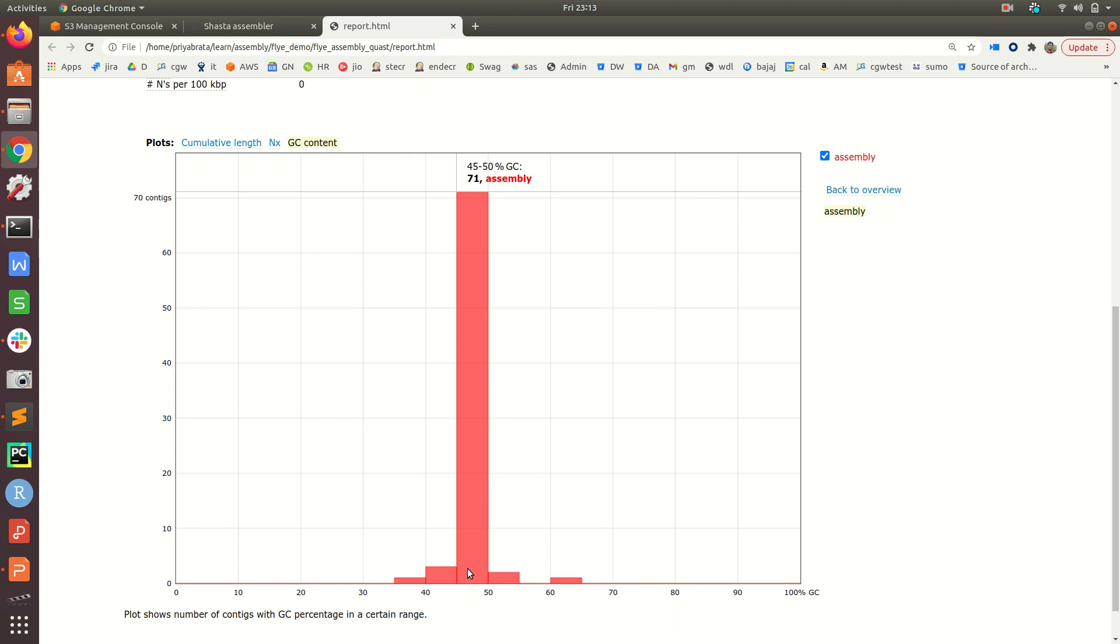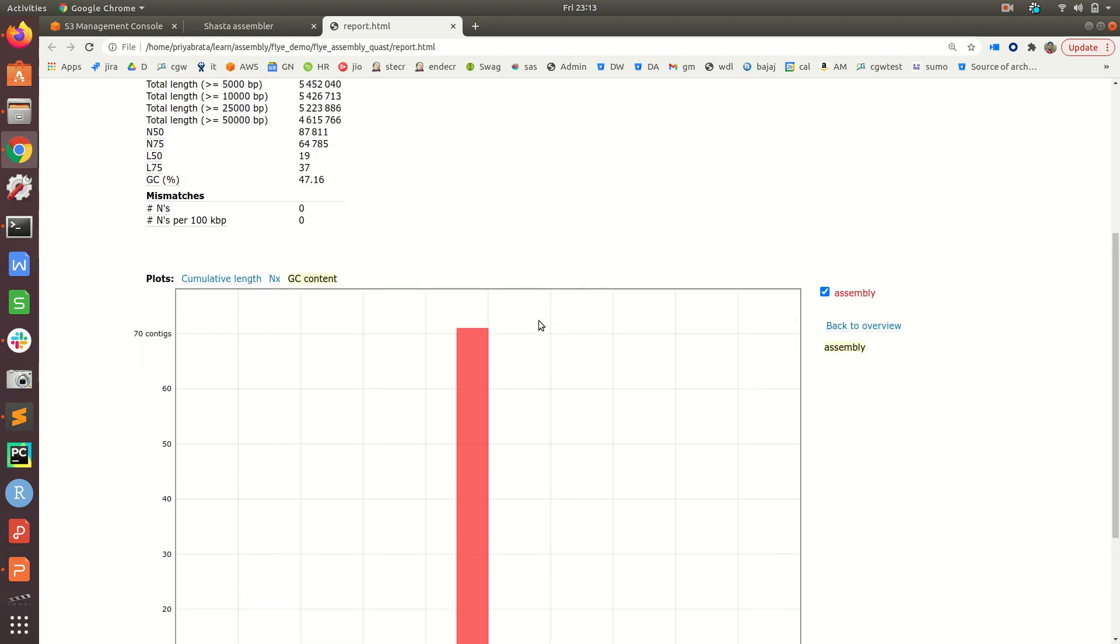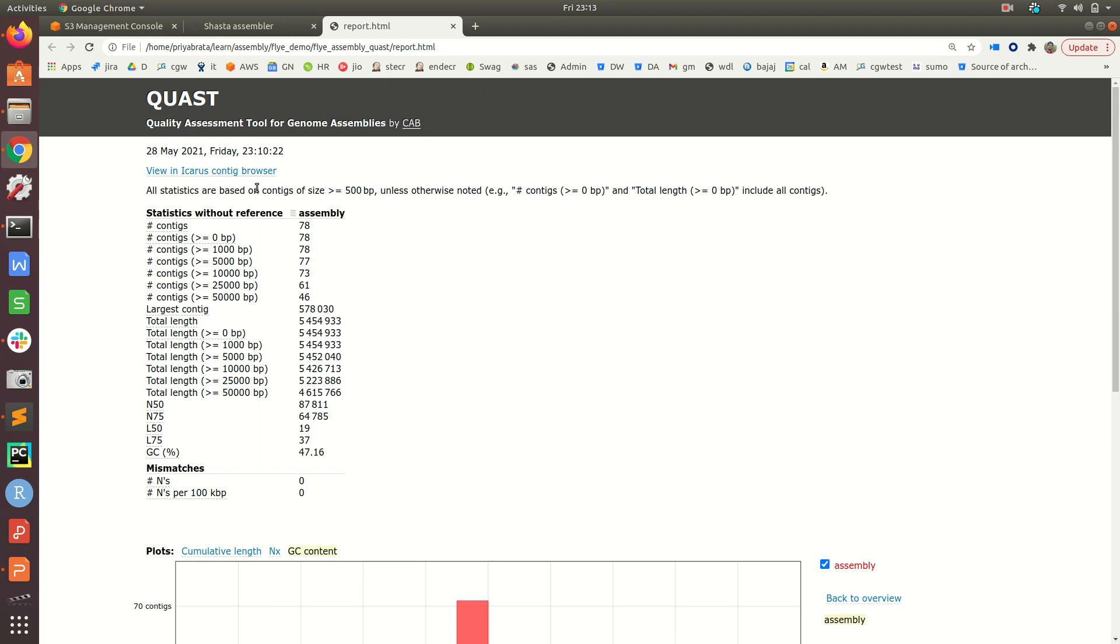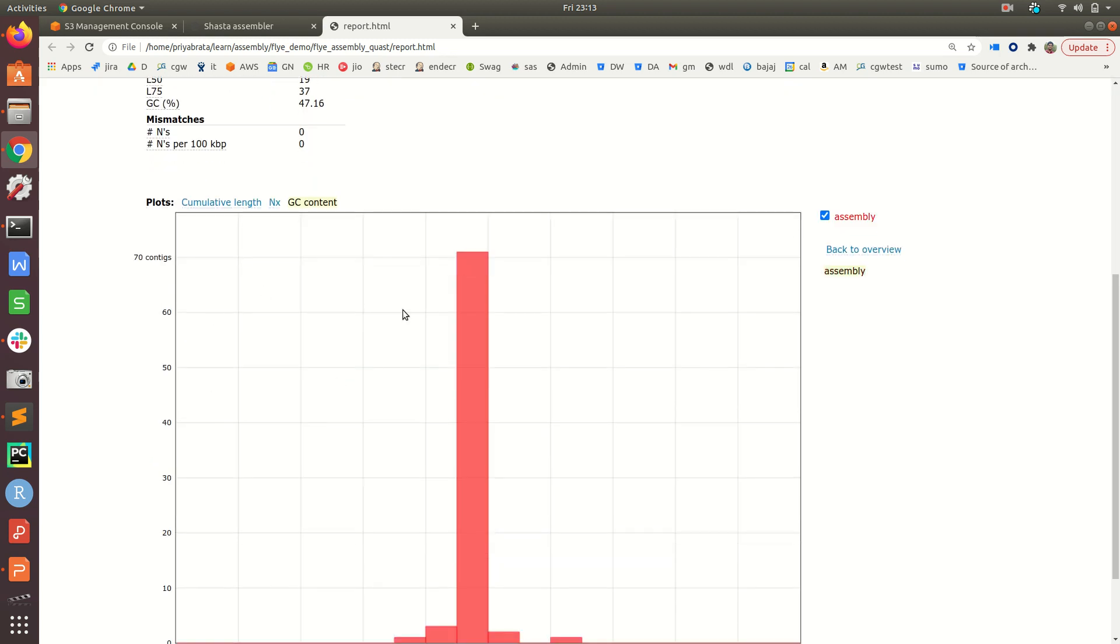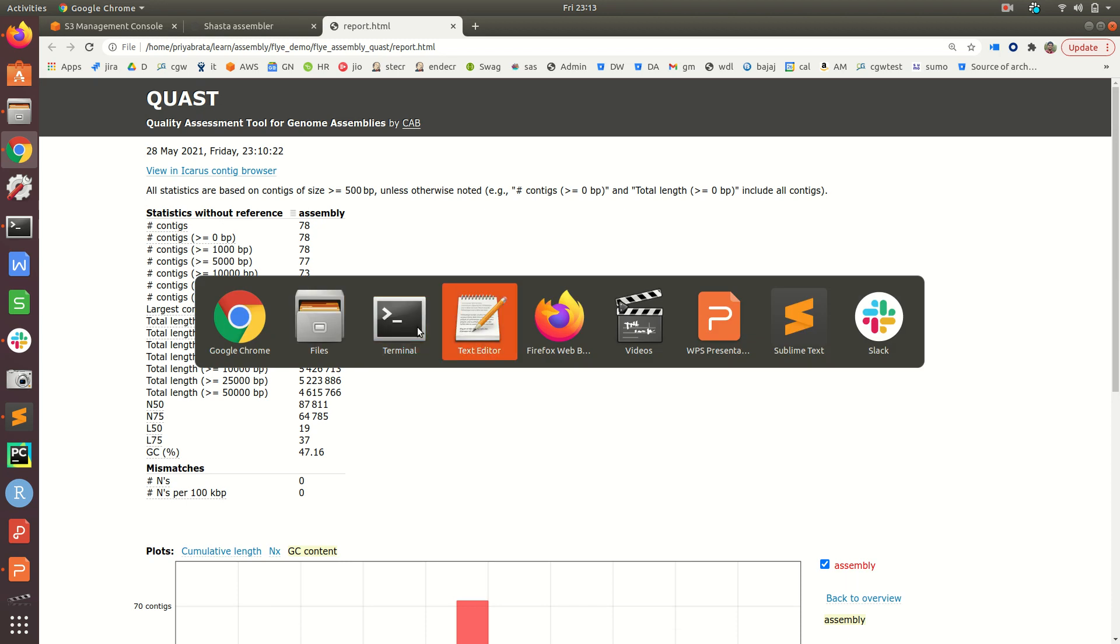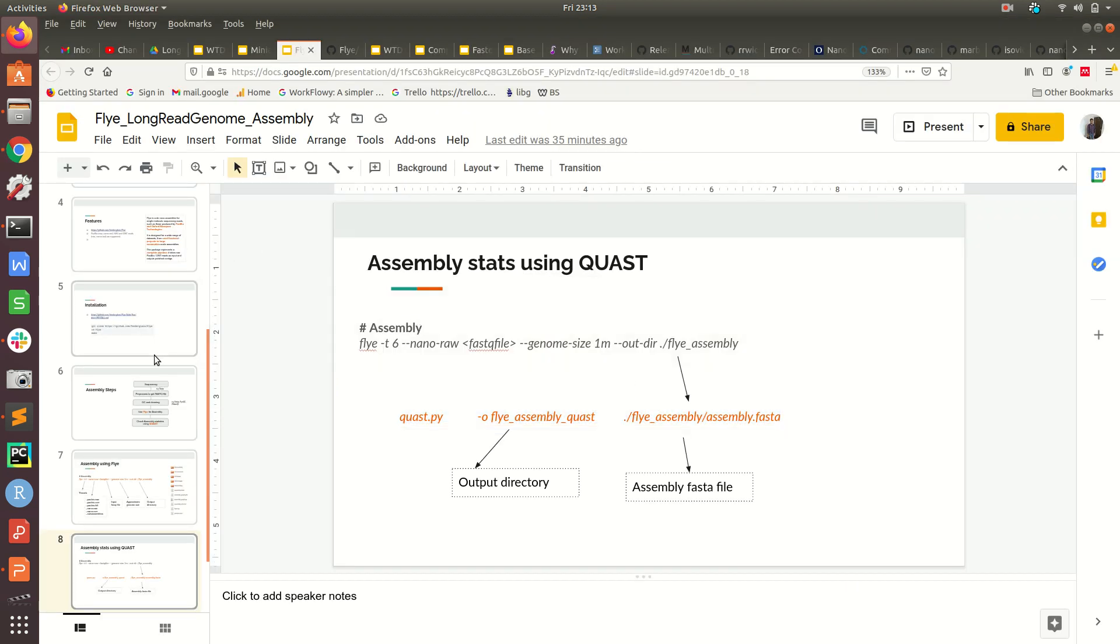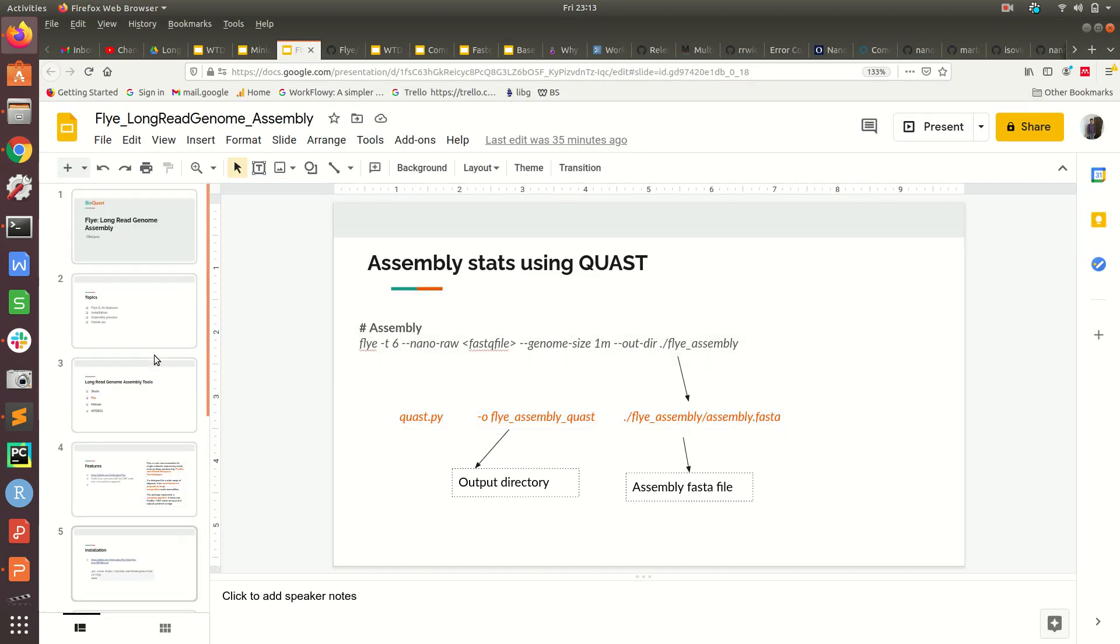Two contigs have 50-55% GC content, and there is just one contig with higher GC content between 60-65%. This way, along with raw statistics and different plots, we get an overview of how Flye has performed the assembly.